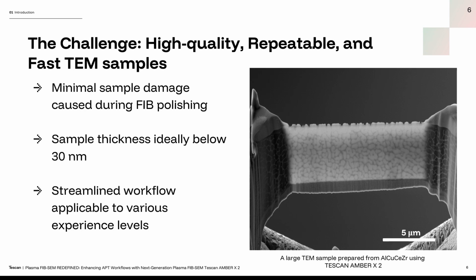So far, I've been speaking about traditional applications of plasma FIB-SEMs. TEM sample preparation or atom probe sample preparation, however, has remained a significant challenge not only for plasma systems, but even for gallium FIB-SEMs, especially when dealing with demanding materials and preparing the samples for high resolution STEM or TEM imaging at the crystal lattice level.